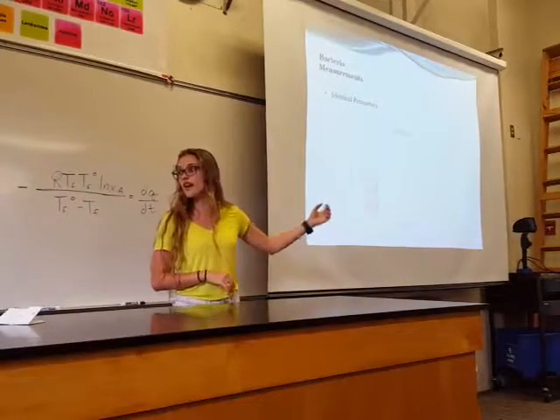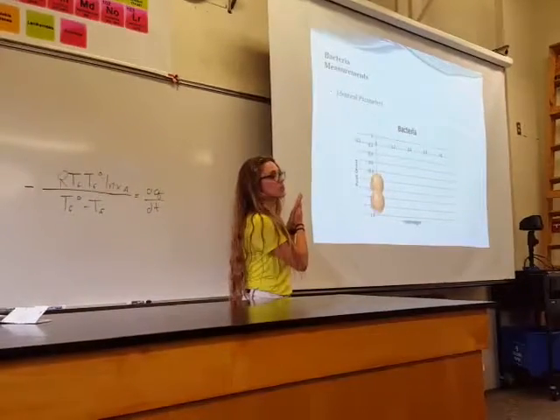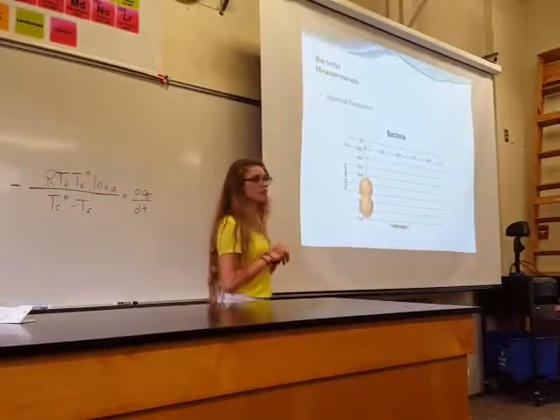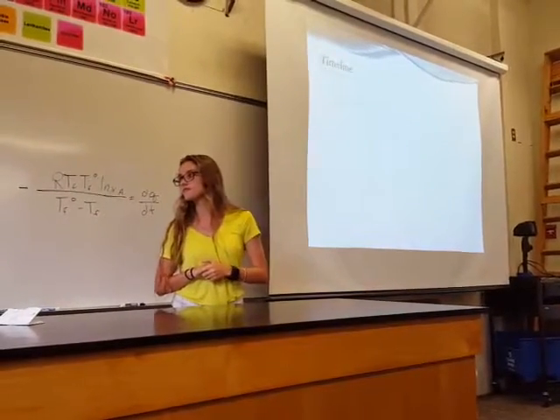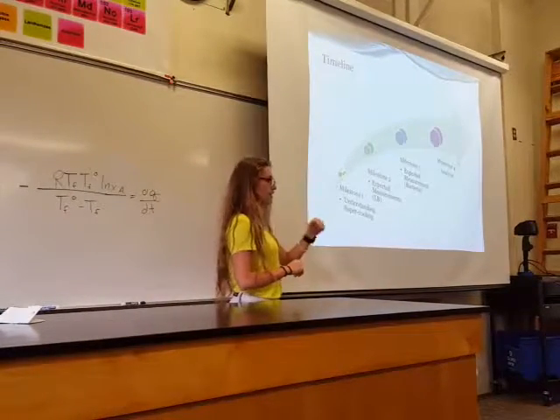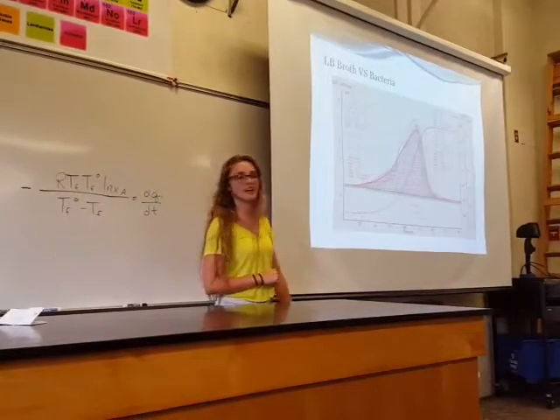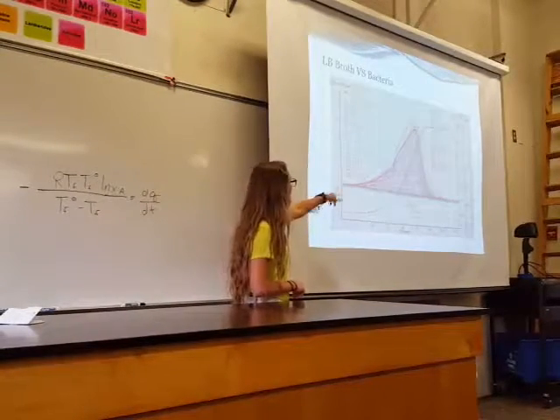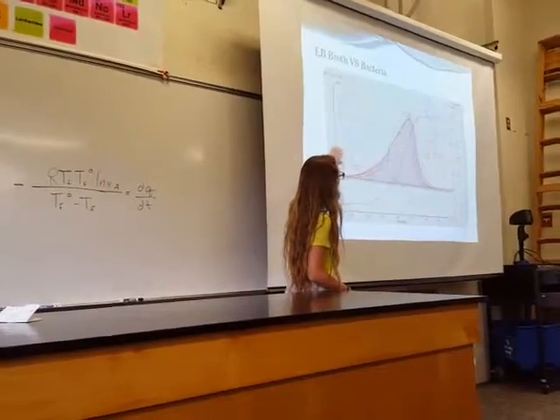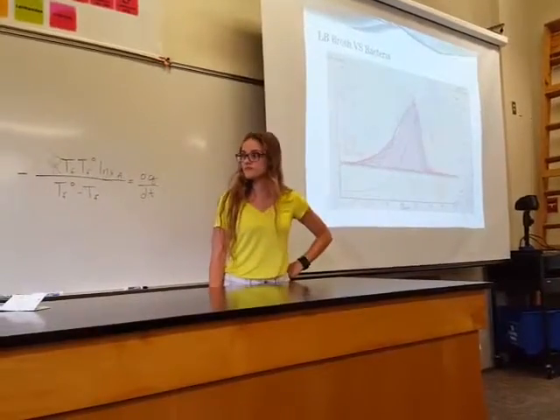And the same thing happened. When you eliminated the peak height, they all scrunched up to the same general area, which is another thing that we'll bring in. And so we were able to figure out the bacteria, so now we just had to analyze our results. And this is, again, some of the analysis that we did, just showing how many different things you're able to learn about the curve with the DSC.